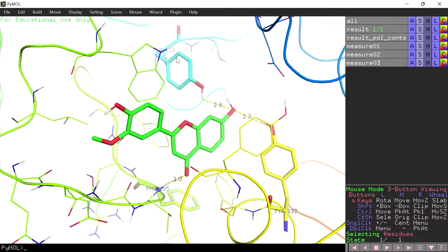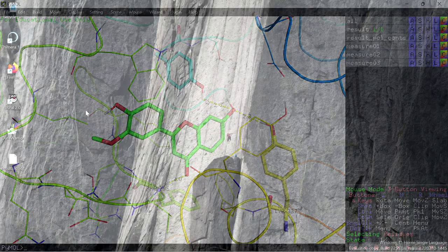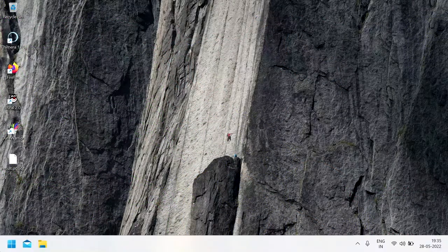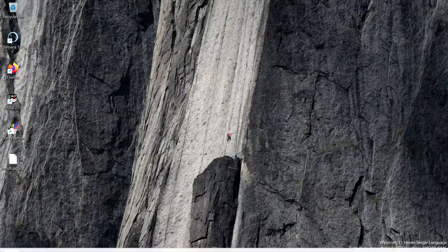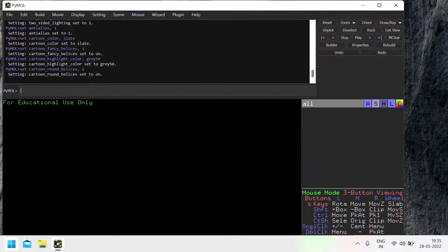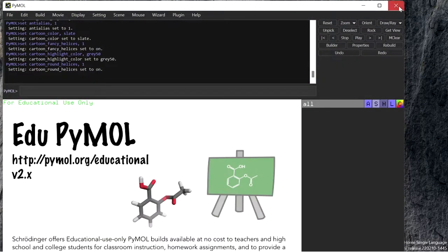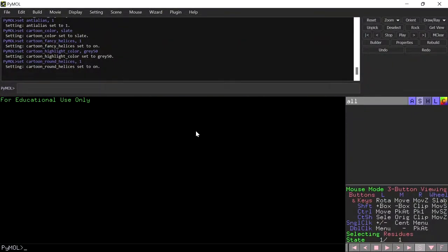Welcome everyone. In this video we are going to see how to analyze the AutoDock result PDBQT file. First, open PyMOL. This is the PyMOL interface — PyMOL has a powerful and very flexible interface, but it is complex for new users. This video briefly introduces the PyMOL interface and shows how to analyze the AutoDock result that is saved in the PDBQT file.